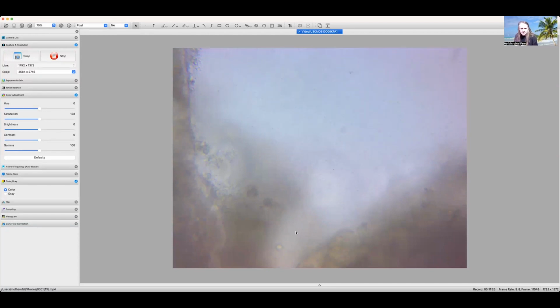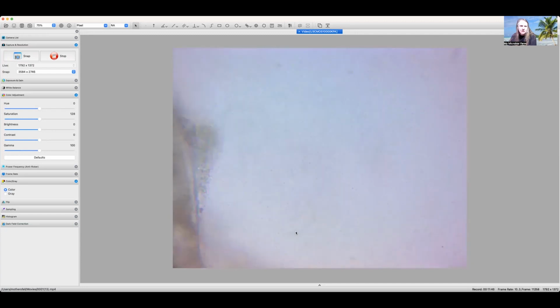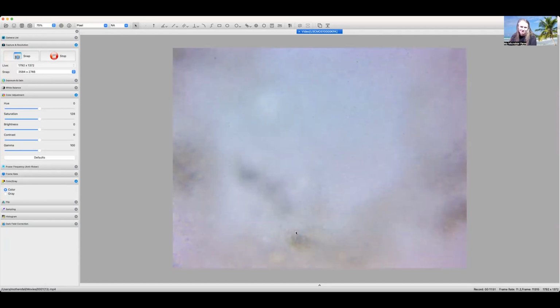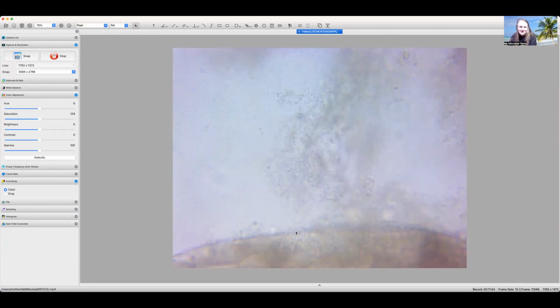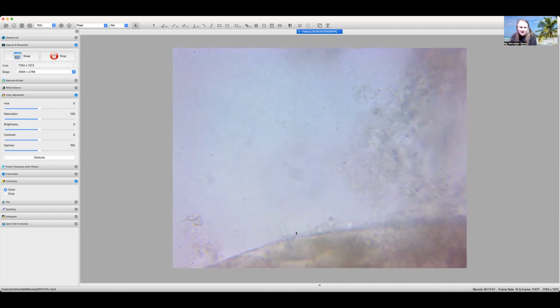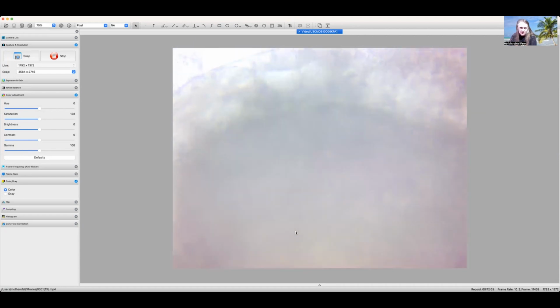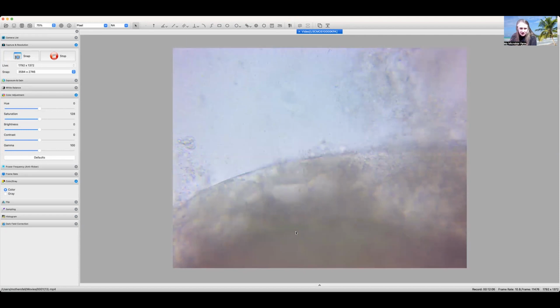This is the 400 total magnification view of the white fungal looking, bacterial looking growth inside of my scrap bucket in my kitchen, which is mostly carbon substances. But I just did a full video of recording and realized I was not recording. So I want to get back to where I had just kind of zipped around and just show you something here. This is just whatever this glob here is, what the white structure basically is.